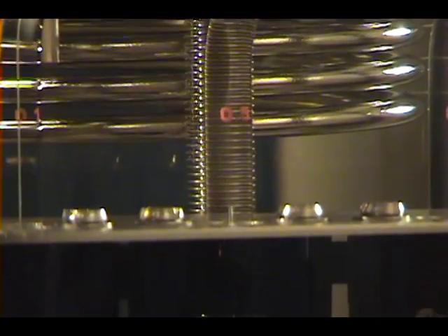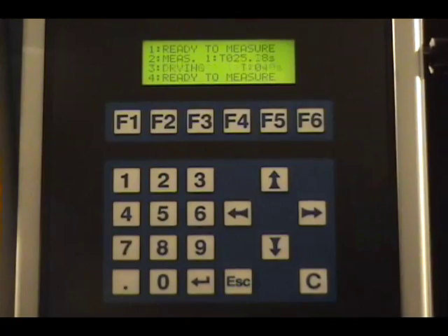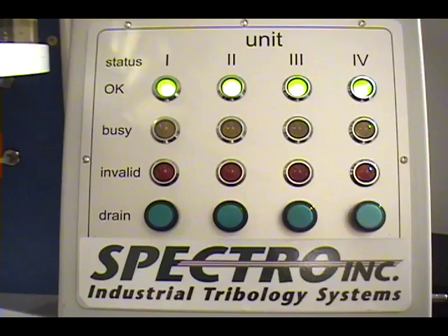When it reaches the first optical sensor, the time measurement begins. This starts the measurement timer which can be viewed on the LCD screen. The busy light for that tube is also illuminated on the control panel.